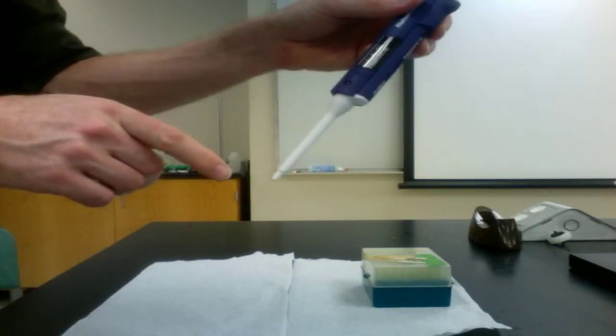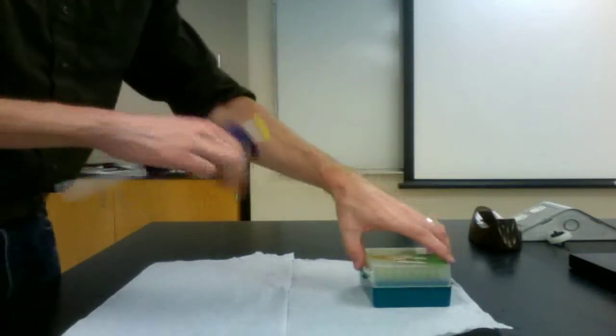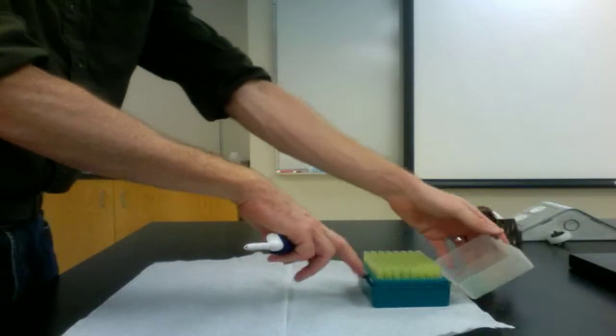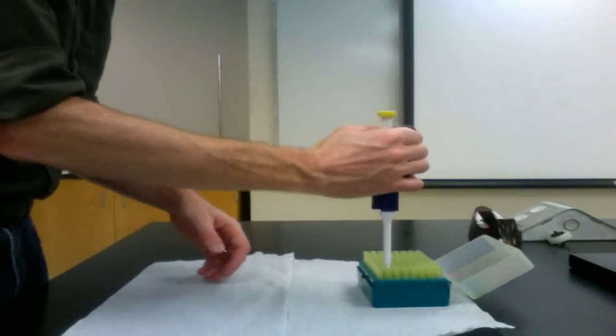Before using the micropipette, make sure that you have a tip in place. Simply press the tip of the micropipette down into one of the tips in the box and it will attach.